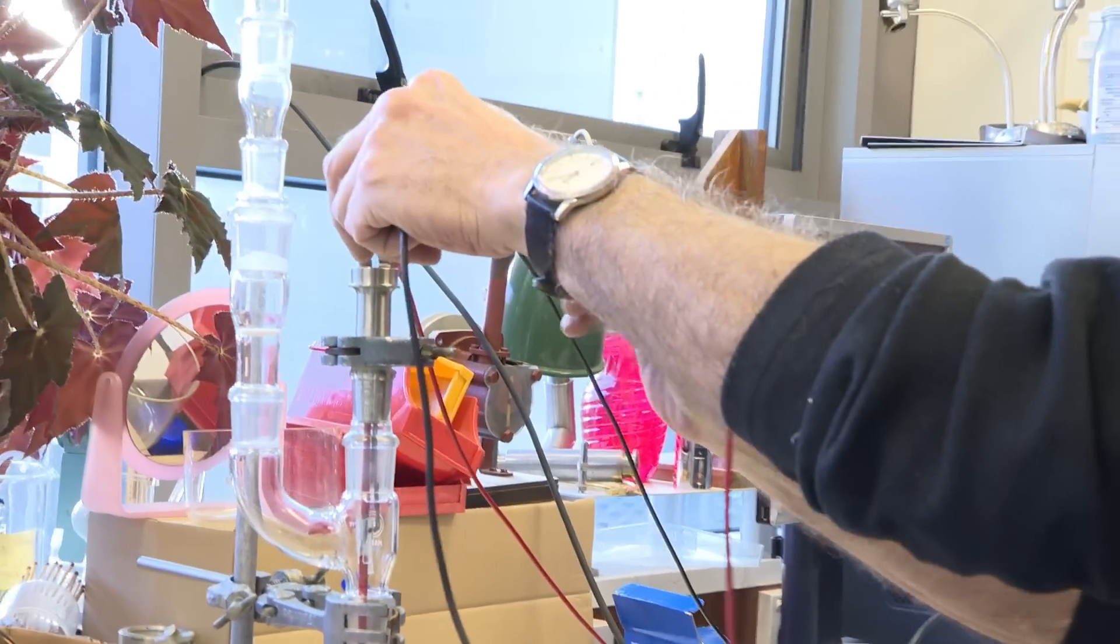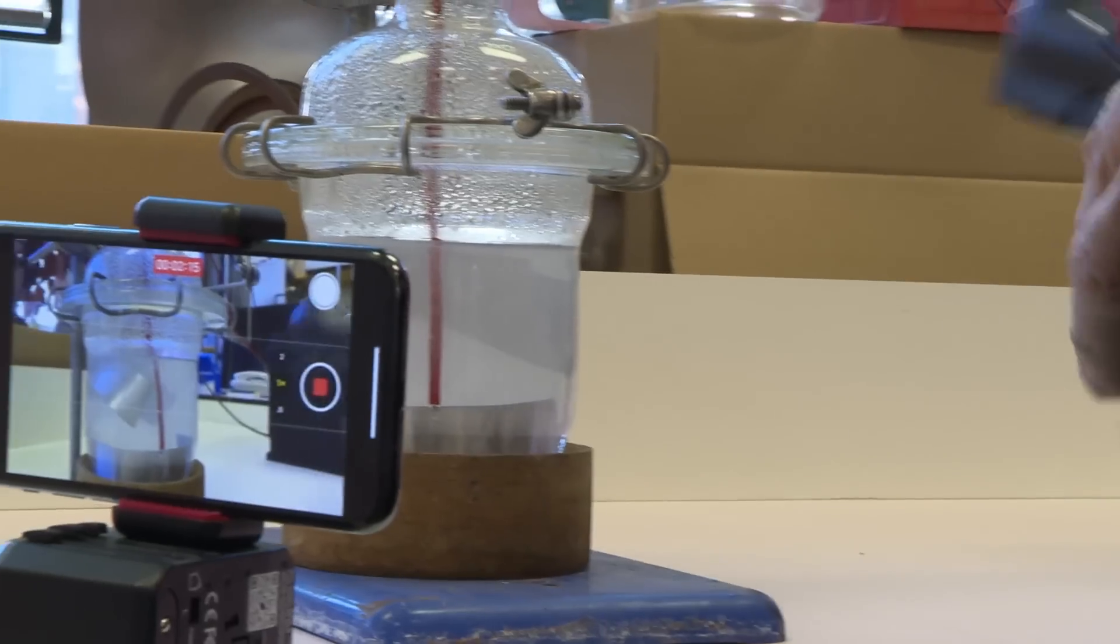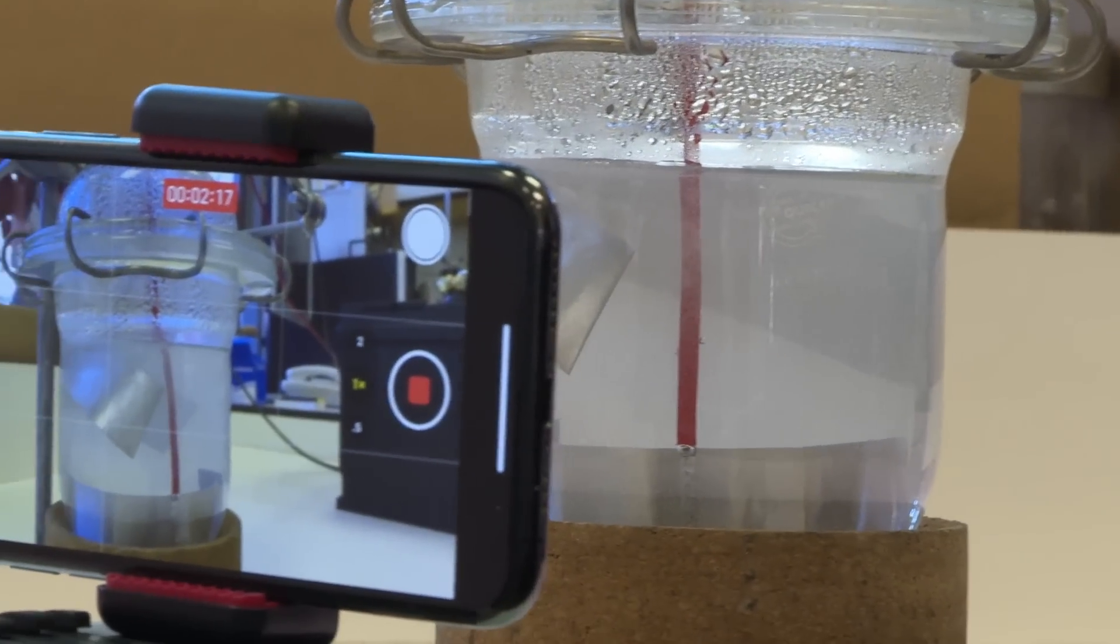Then, you can make hydrogen by electrolysis, passing electric current through water containing something that makes it slightly more electrically conducting than pure water. Neil used a small amount of sulphuric acid for the process, but there are a variety of things you can add.